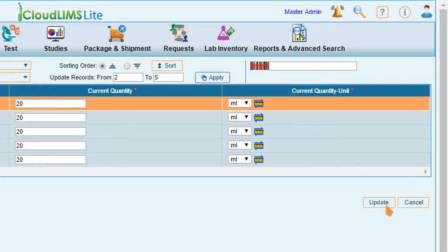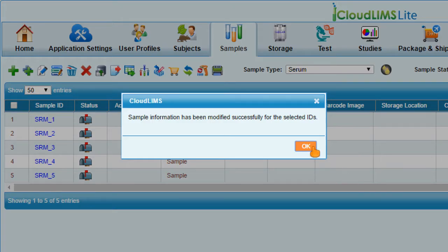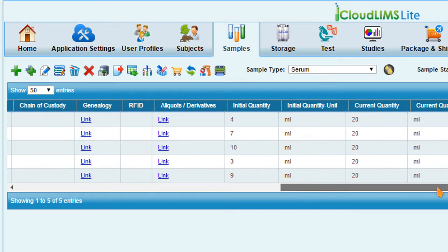Click Update to apply the changes. The value for selected attribute is now updated in all the selected samples.